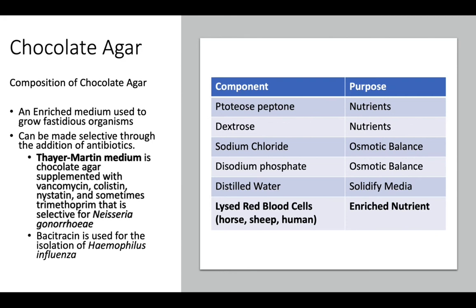Another one you might have heard of was Neisseria gonorrhoeae. So perhaps gonorrhea sounds familiar. That's not just going to grow on blood agar or LB. We have to put it on chocolate where all the nutrients are available. It's picky, which we call fastidious.